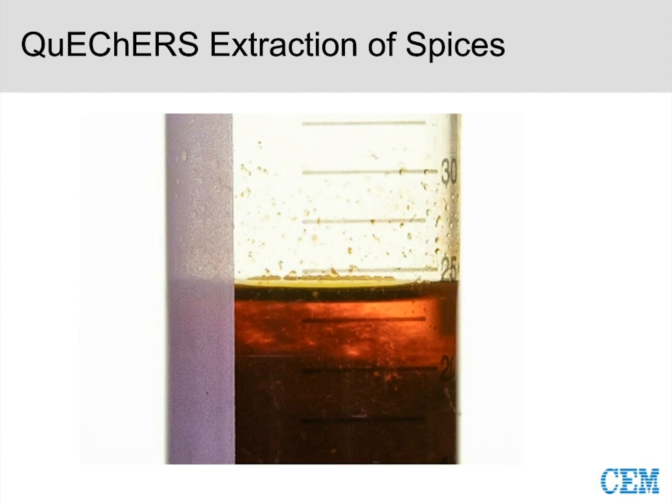And keep in mind, this is for that small sample size of 2 grams. If we had run 10 to 15 grams of the paprika here, we certainly would have nothing to work with. We wouldn't have anything we'd be able to move over to the next step. So again, there's room for improvement just from a process alone. And then we'll talk about data later on.